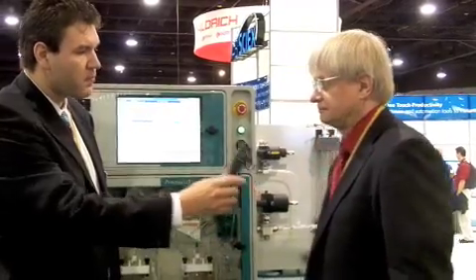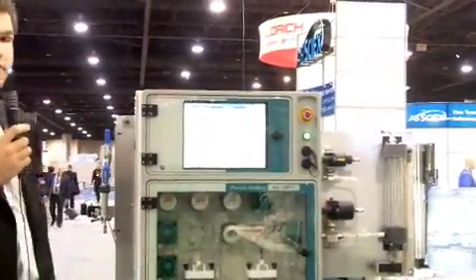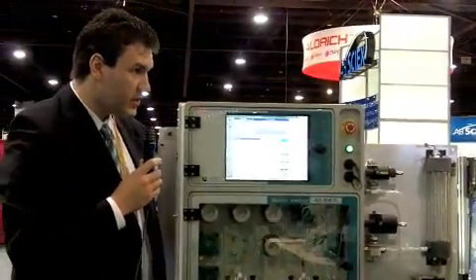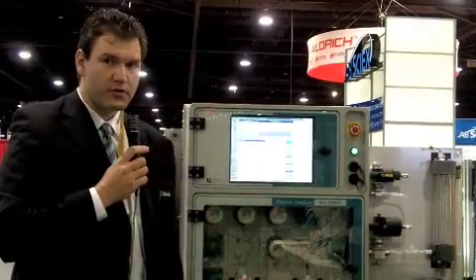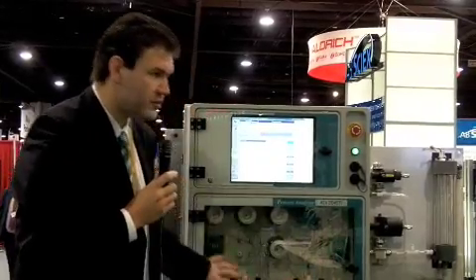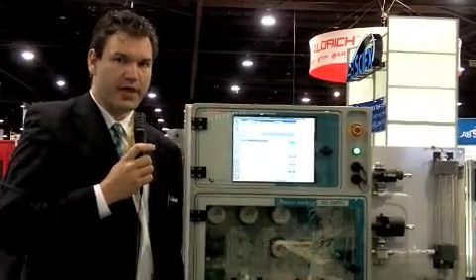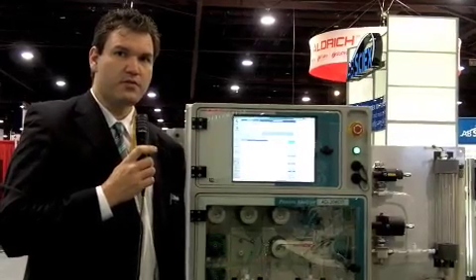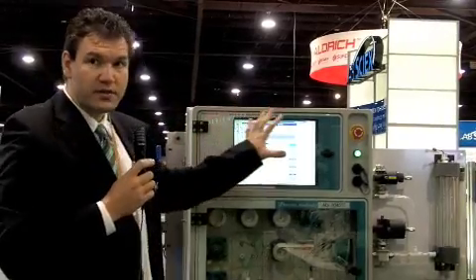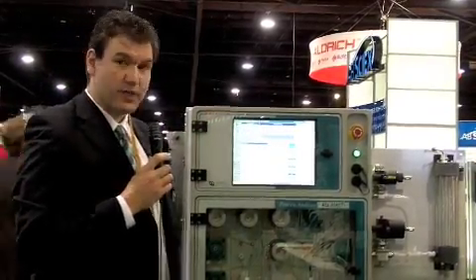The ADI 2045 Ti is a brand new analyzer — it has been completely reworked over the previous version. All the modules we offer, which are flexibly arranged, have been completely newly developed, as has the hardware inside. Our software interface is also completely new.